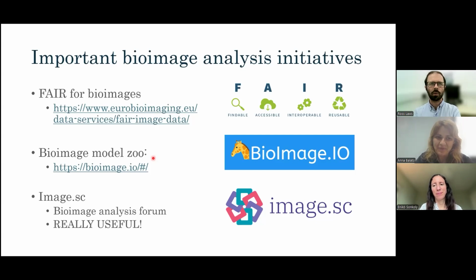Well, what I'm hoping to do after I finish my PhD is develop a fully automated workflow for processing the data in the facility that we can deploy to users who come in to look at specific kinds of targets in the data. So, for example, if someone is looking at mitochondria, the plan is to capture their data sets, then post-process the data automatically, and then segment the data automatically as well.